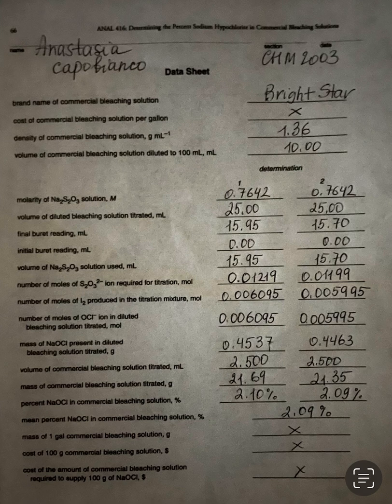Next, the number of moles of the thiosulfate ion required for the titration, in moles. How do we find it? We know the molarity of sodium thiosulfate, right? It's 0.7642 in my example, and it's the same for both determinations. And we know the volume of sodium thiosulfate for each determination. For the first one, I have 15.95. For the second, I have 15.70.